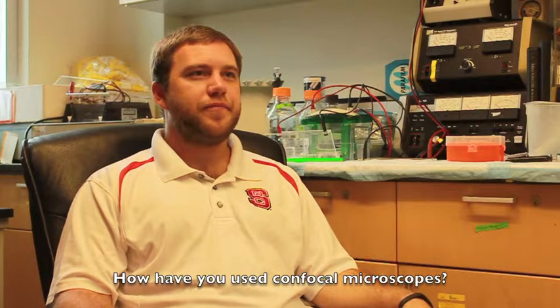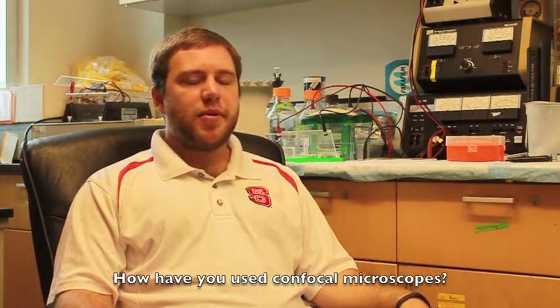What are some of the applications that you use confocal microscopes for specifically in your work? In some of my previous work, the biggest thing to do would be looking for specific proteins. So we would use antibodies that were attached to a fluorescent molecule, and those would bind to our protein in the cell, and then we could say, okay, this protein is in this portion of the cell at this specific time, or okay, our DNA looks like this in the cell right now.